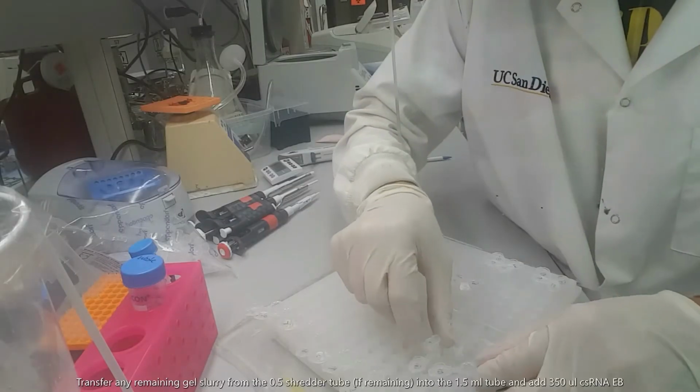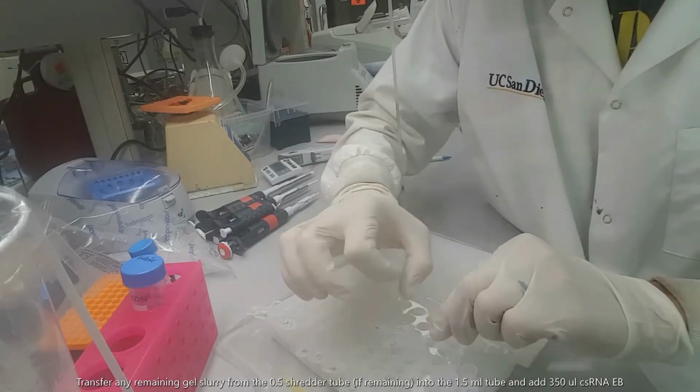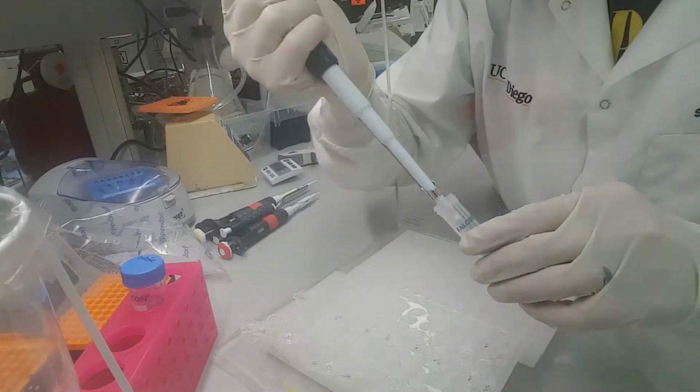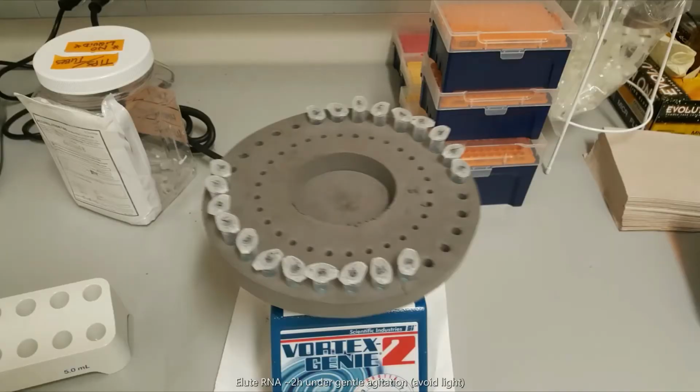Following the shredding, transfer the slurry into the 1.5 milliliter tubes and add 350 microliters of csRNA-seq elution buffer. If you're new to the method, you may consider adding some RNase inhibitor here too. Ensure the slurry is nicely resuspended in the csRNA-seq elution buffer and elute the RNA under gentle agitation for about 2 hours.